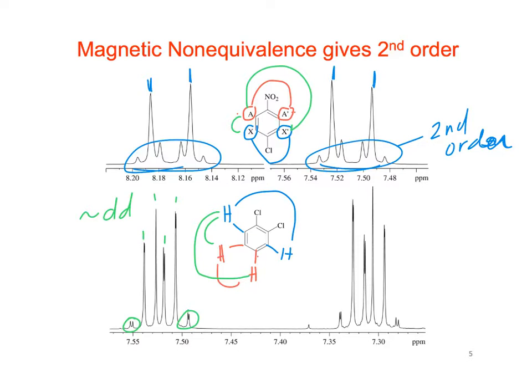The chemical shifts get skewed to one side. Why does it flip? Well, they're like mirror images almost, the couplings, right? Because it's two sets of protons. So essentially, one signal is the blue protons, and one signal is the red protons, because they still have chemical shift equivalence, right?